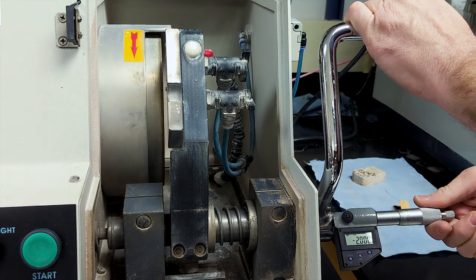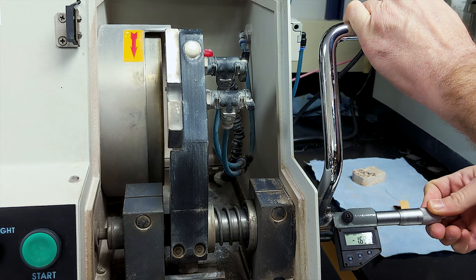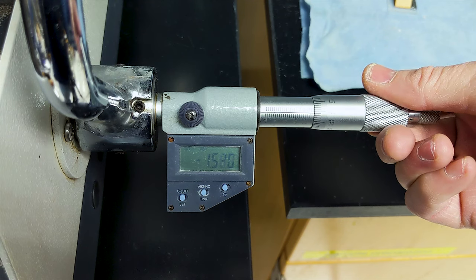As material is ground away from your slide, the sample holder is moved horizontally and precisely by turning the side arm using the built-in digital micrometer for guidance.